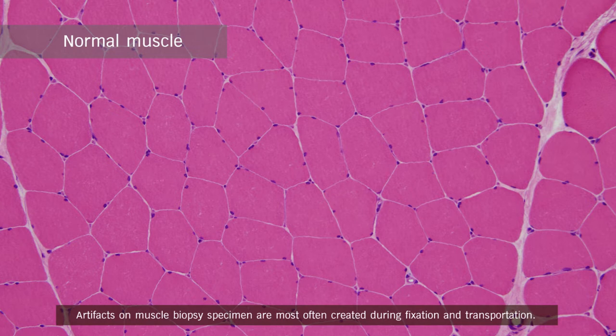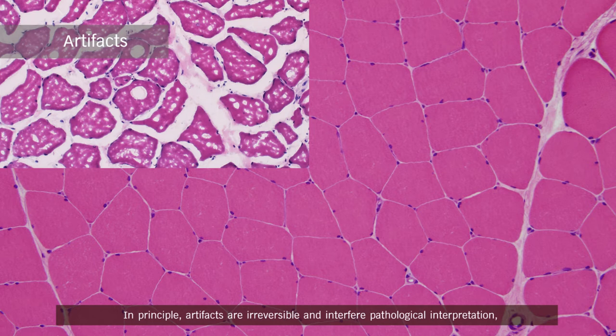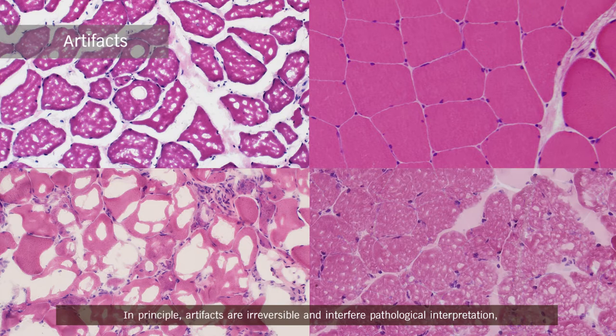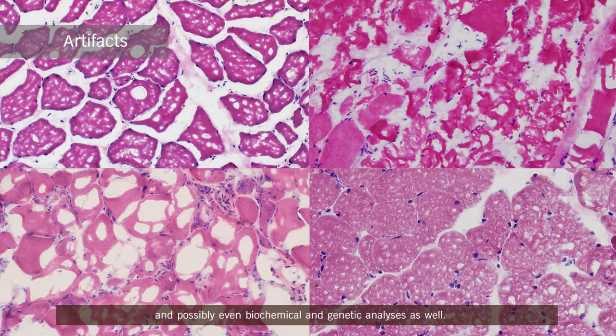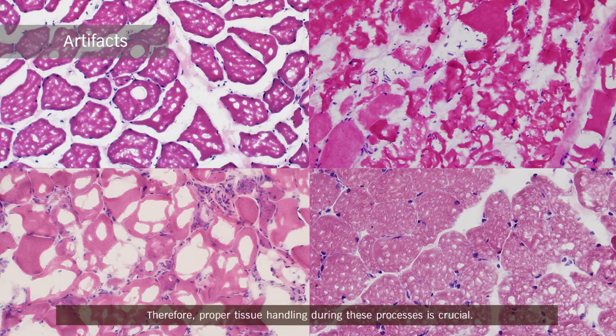Artifacts on muscle biopsy specimens are most often created during fixation and transportation. In principle, artifacts are irreversible and interfere with pathological interpretation, and possibly even biochemical and genetic analysis as well. Therefore, proper tissue handling during these processes is crucial.